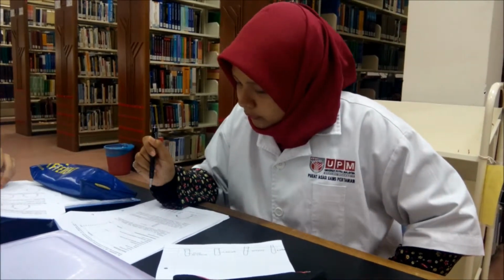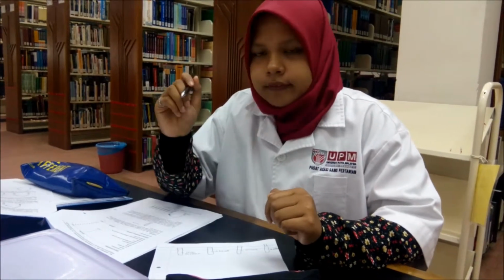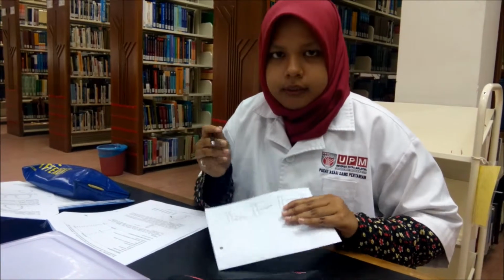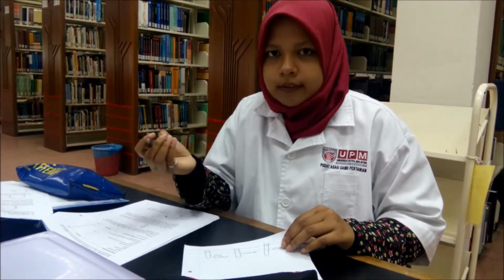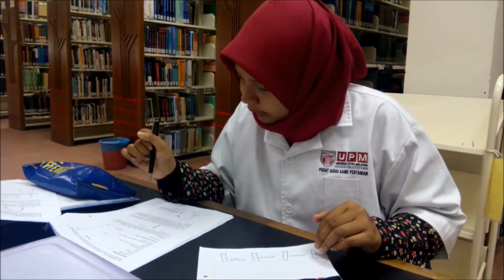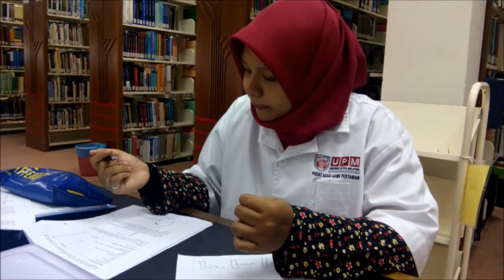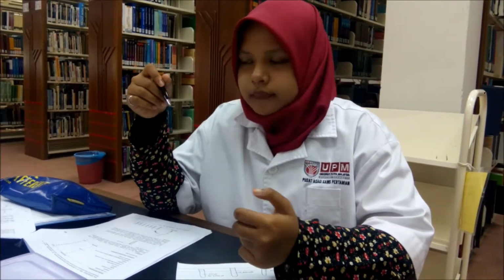Using a clean micropipette, we pipette 500 microliters of stock solution, this one, into each of the 7 labeled cuvettes. The stock solution is a strong base, so we must be careful so it doesn't get on our skin or clothes. The micropipette must be washed well with water.